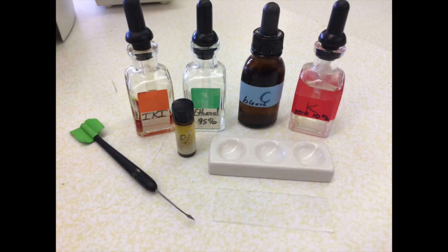There are four main reagents used for spot testing, which are abbreviated as I, P, C, and K. The I test, or IKI test, uses iodine potassium iodide to detect starches. The P reagent, which is short for paraphenylenediamine, comes in a powdered form and needs to be mixed with ethanol before each reaction. The C reagent is household bleach, and the K test is potassium hydroxide.